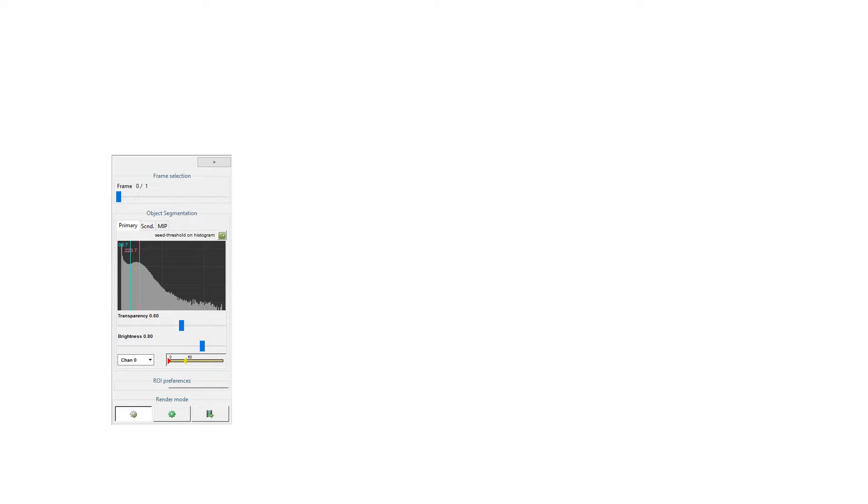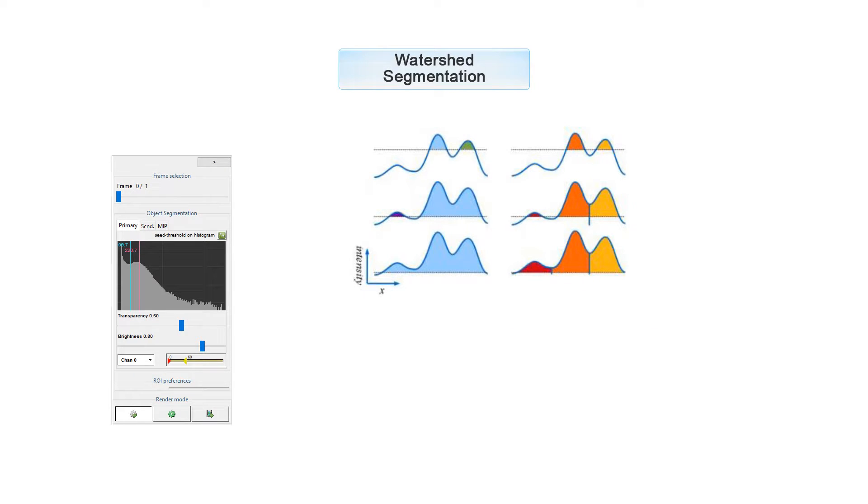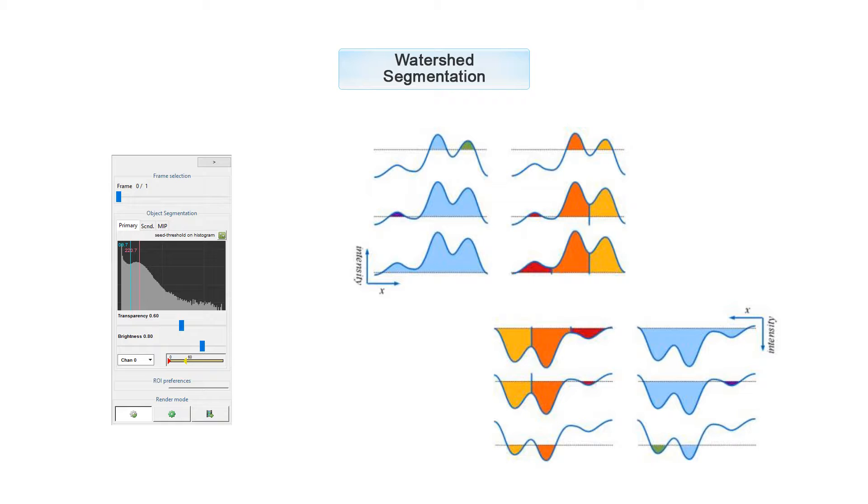There is also a third way to segment, if simple thresholds fail, in case of segmenting dim objects and separating close objects. This is called Watershed Segmentation. In the picture on the right you can see that if you turn the graph upside down, it looks like a watershed, hence the name.